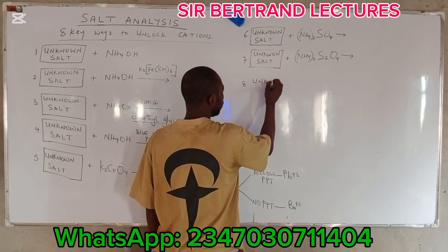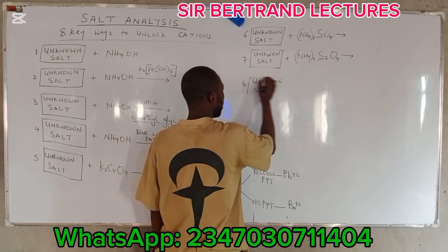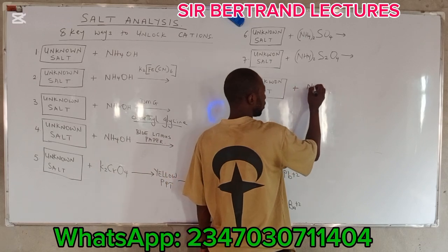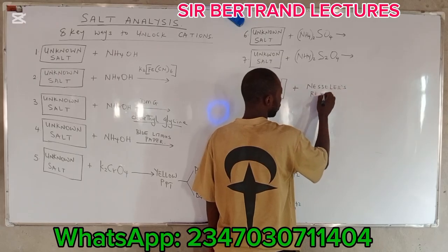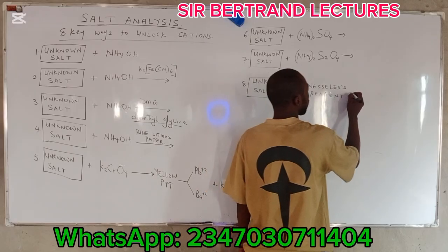To an unknown salt sample, here you add Nessler's reagent. You add Nessler's reagent, all right?